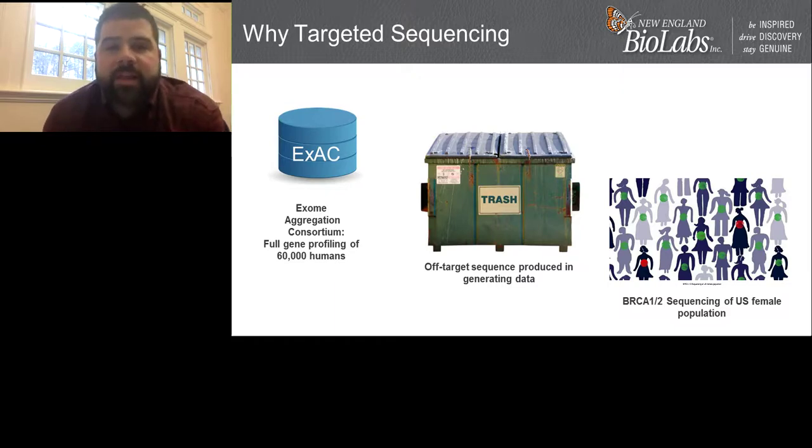So I think this highlights the importance of having targeted enrichment solutions that really work well and are able to zone in on the regions that we're particularly interested in. What we'll spend much of the time on today is thinking about the different options that are available there and how to choose the best fit for a given undertaking.